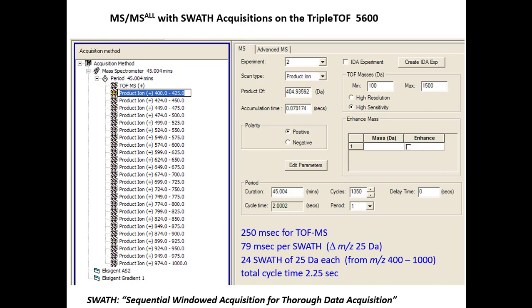You can get it from there. They have documents for users and customers. So each of these windows has a distinct mass assigned. This has nothing to do with how you later analyze your data, and that will all be automatically filled in. It's just so that they can determine a certain collision energy.